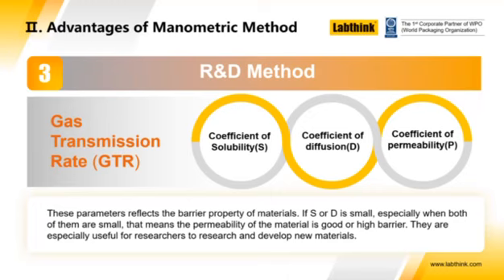And so D3985 was developed specifically for the measurement of oxygen, that being the most common concern for people who are testing products for food packaging. It was designed to make the process much easier to measure and much easier to use, with less operator intervention, much more automated, and so on and so forth.